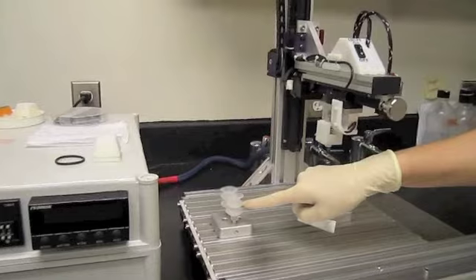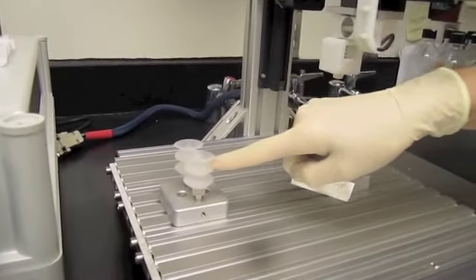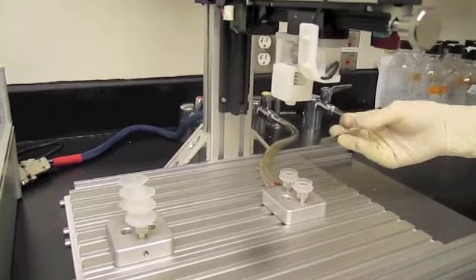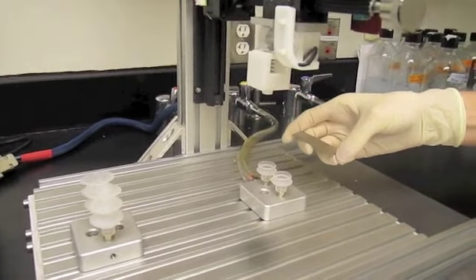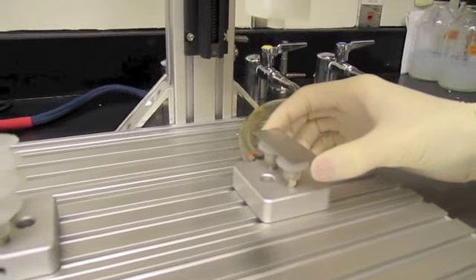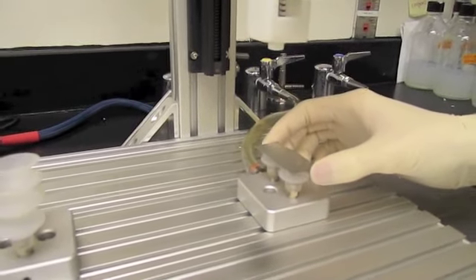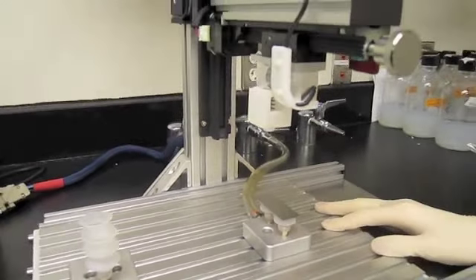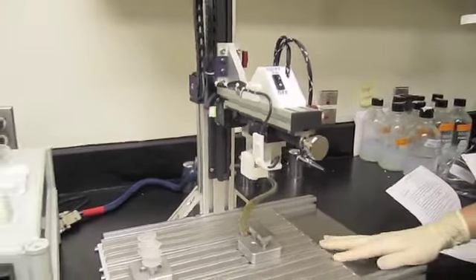The larger suction cup platform is for touching, not swiping. The machine does both. Place the surface to be swiped on the suction platform. Once the surface is on the platform, move the platform itself so that the surface is vertically aligned under the swiper.